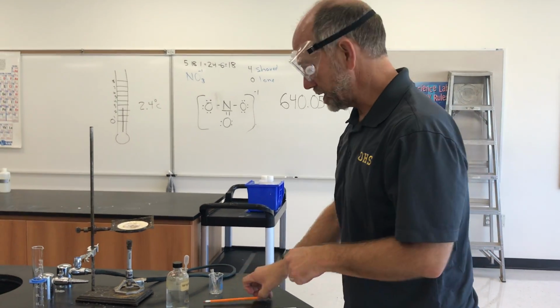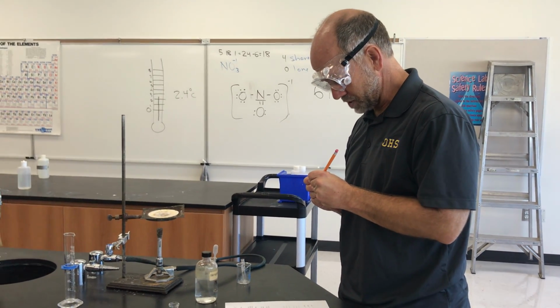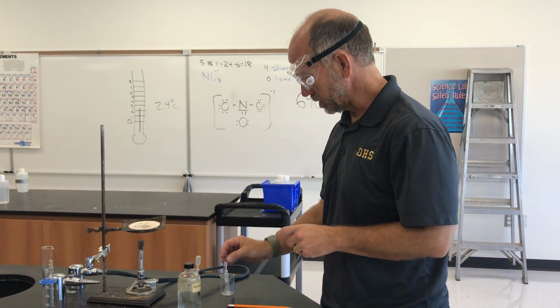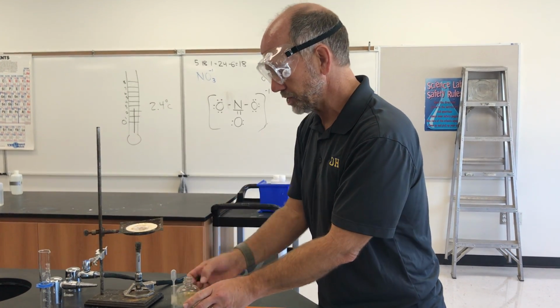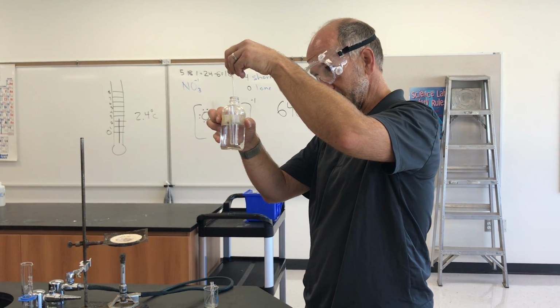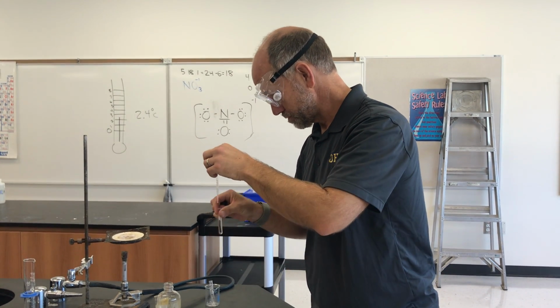Now the last thing that we need to get a sample of is actually sulfuric acid. This we're going to certainly be careful with. So following step number 3, we will label that test tube H2SO4 or sulfuric acid, and we will draw up 3 milliliters of this, similar to the way that we did the calcium chloride. There's 1 milliliter.